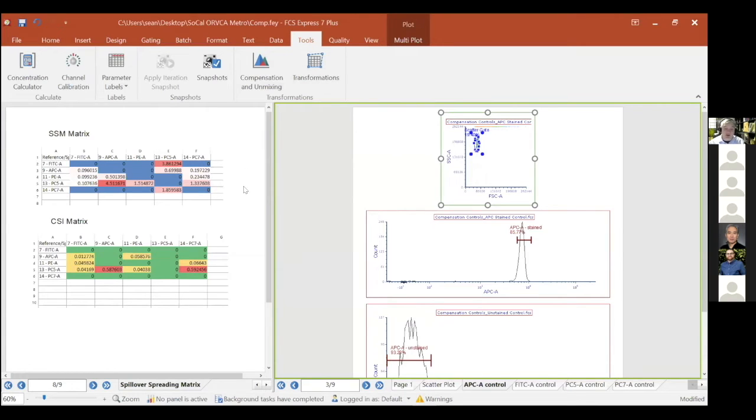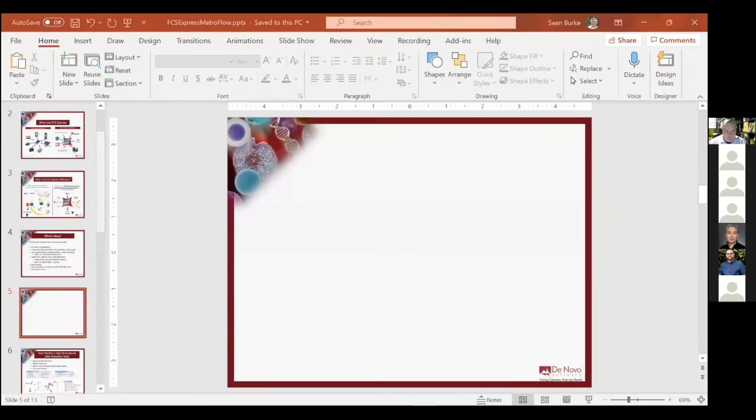And that's also going to work for unmixing, which is a really great tool if you need to come in there and see what those different changes with your unmixing controls are doing. You get that result and that feedback immediately.